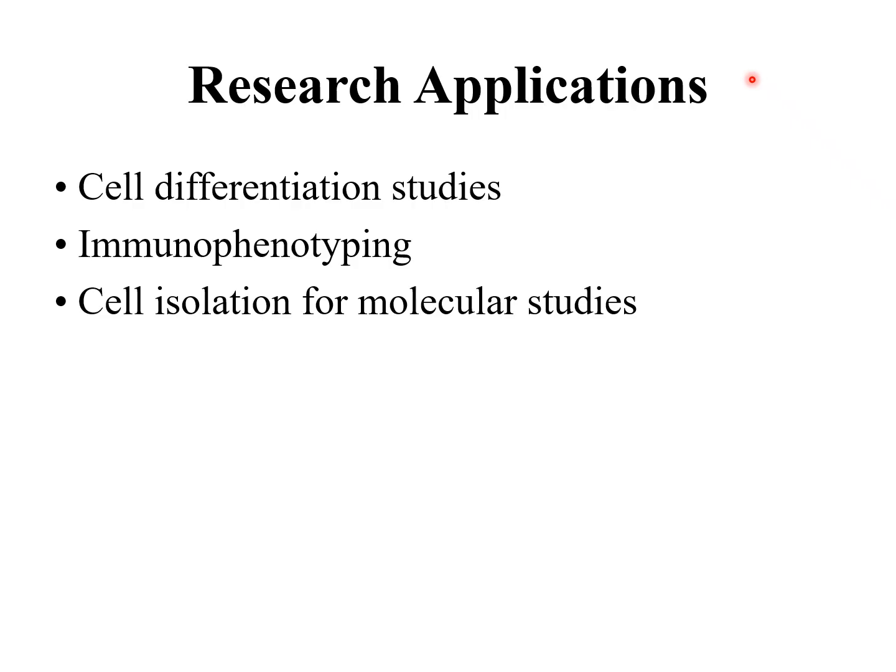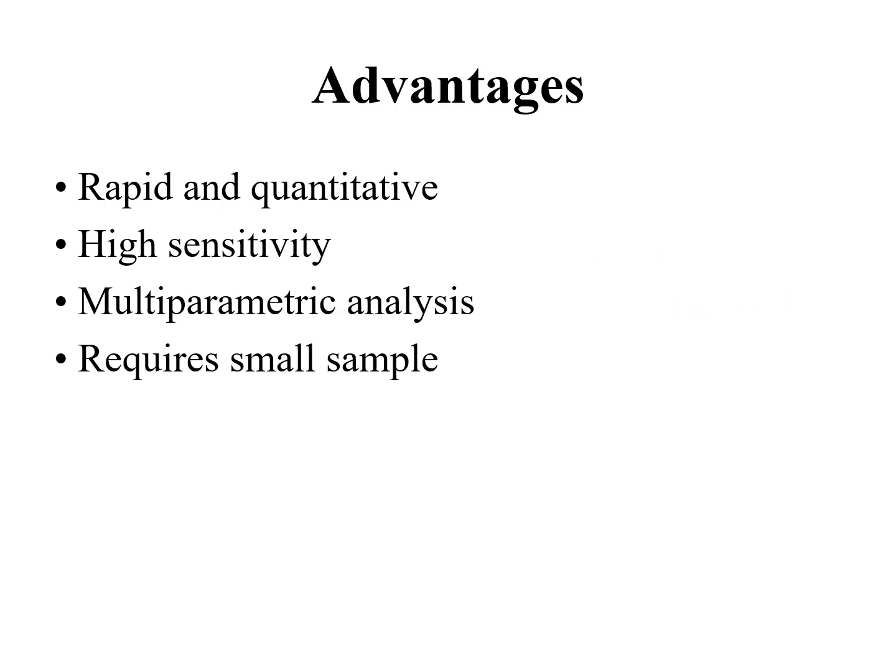So flow cytometry has wide applications. It can be used for cell differentiation studies, for immunophenotyping, and for cell isolation for molecular studies. Advantages include rapid and quantitative analysis, high sensitivity, multi-parametric analysis, and requires small sample.